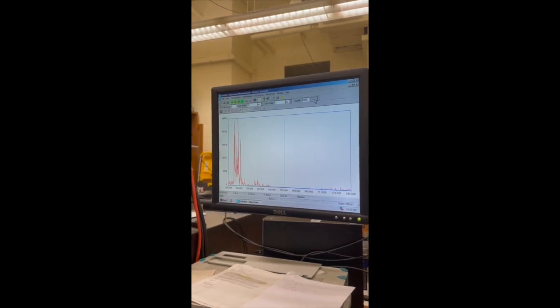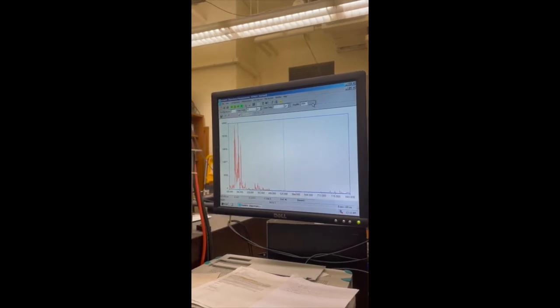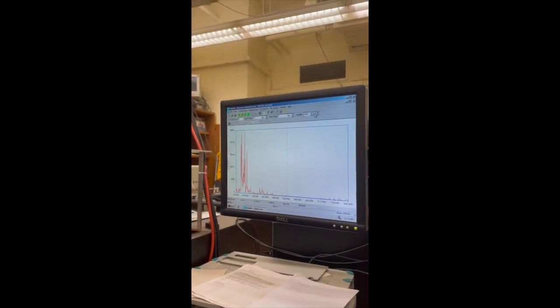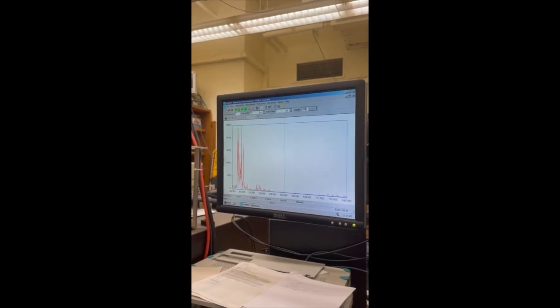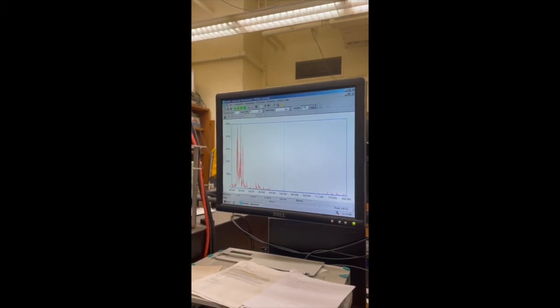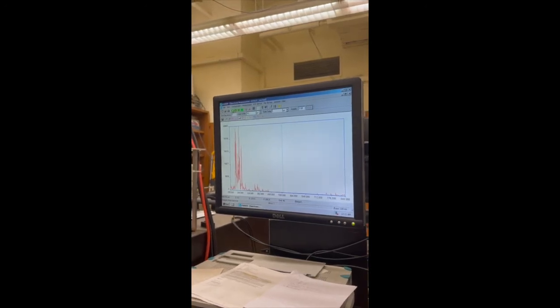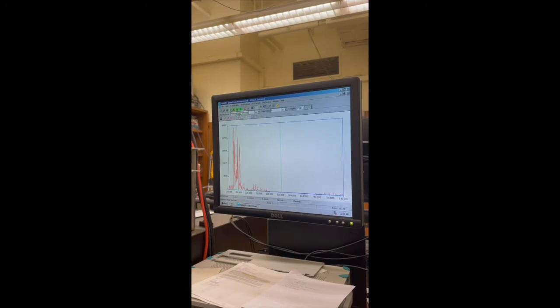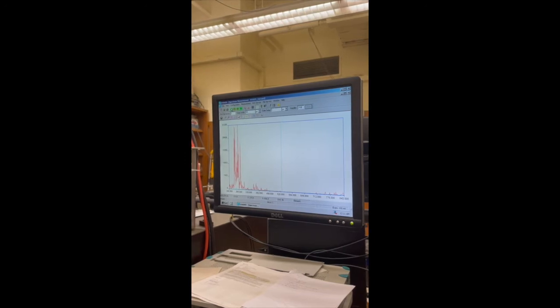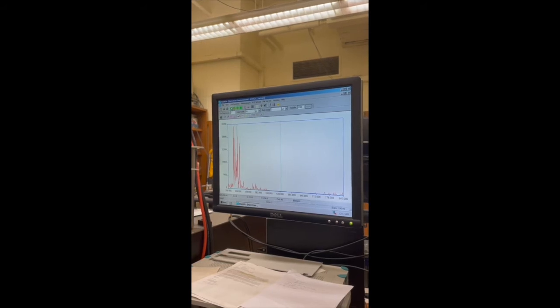Now, what do you think would happen if we changed the amplification? I believe all of the intensities would increase somewhat relatively compared to where they are now. So it's just like turning up the volume on the speaker or the amplifier. So let's make it 2100. I'm going to click apply. And now we're going to be back to 3 clicks, right, Dr. Rehse? Correct. Sounded like 3. So now it's 37,000 as opposed to 21,000. That's a pretty good amount.